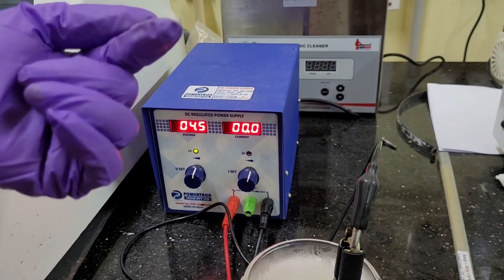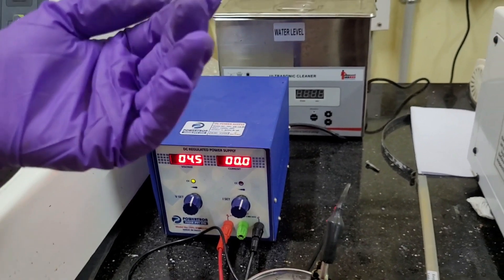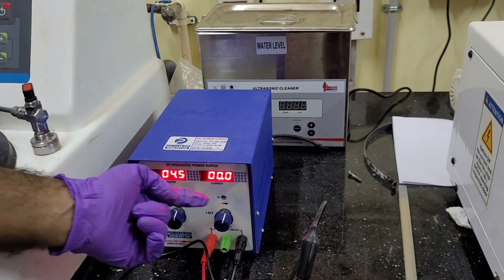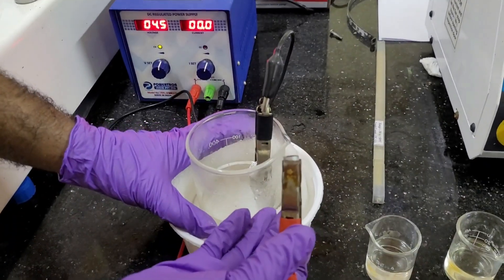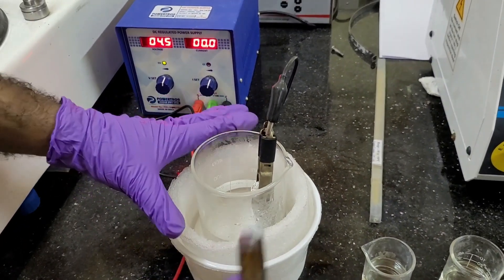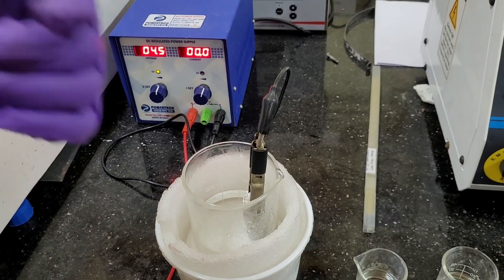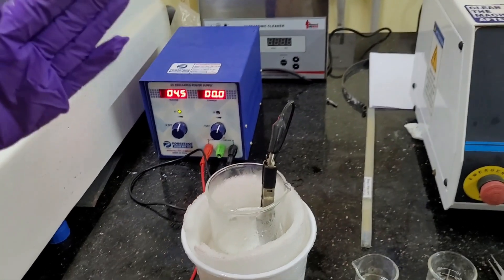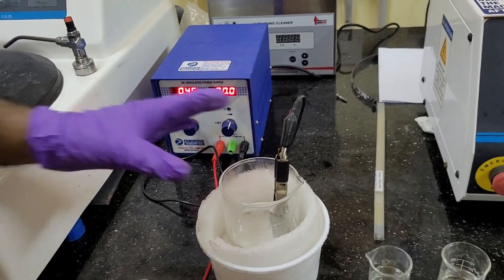And in this parameter, there are four different parameters. First one is the voltage. Second one is the current. Third one is the temperature, what we have achieved here. And the fourth one is the time, what we are going to use to do the electropolishing. So, these four parameters are very important to maintain or optimize.